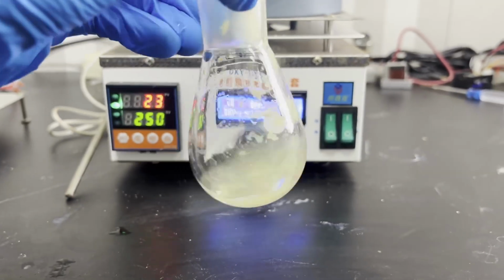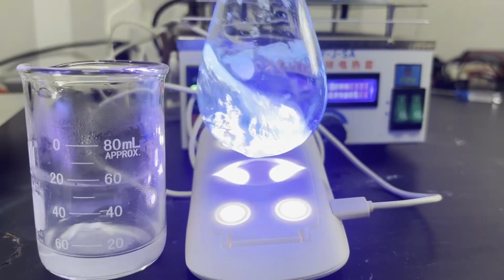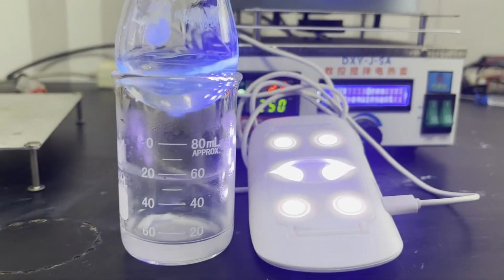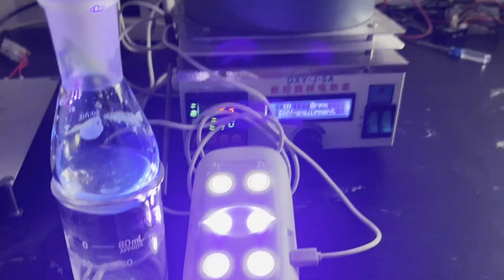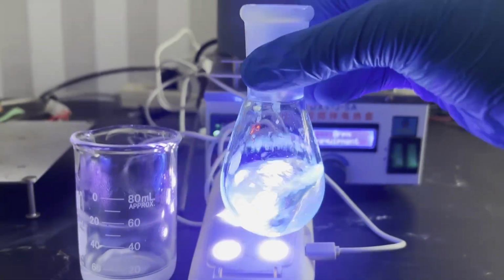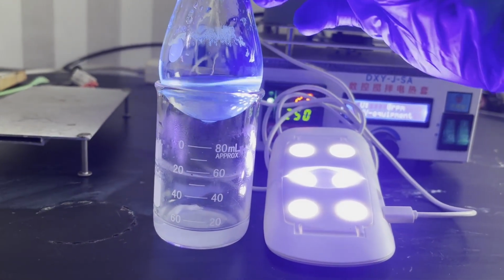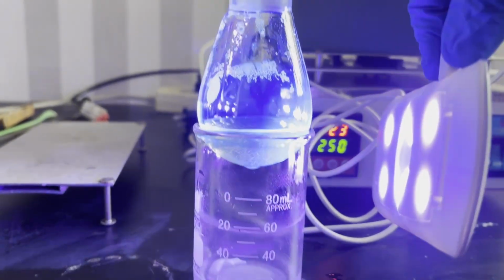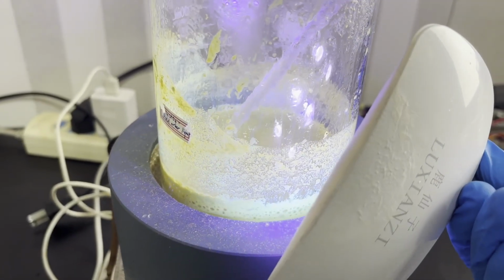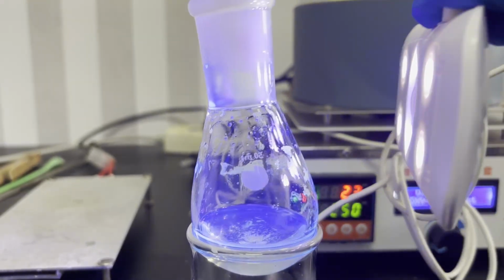While this is underway, I added a bit of water to the original flask and placed it under a UV lamp. You can see that the water underneath has no fluorescence, but the contents of the flask emit an intense and beautiful blue fluorescence, proving that our reaction is successful. Although acridone is almost insoluble in water, the suspension still emits such a strong fluorescence, demonstrating the potency of the compound. Interestingly, the mixture in the large beaker doesn't display such a bright fluorescence, probably because of concentration quenching effects.